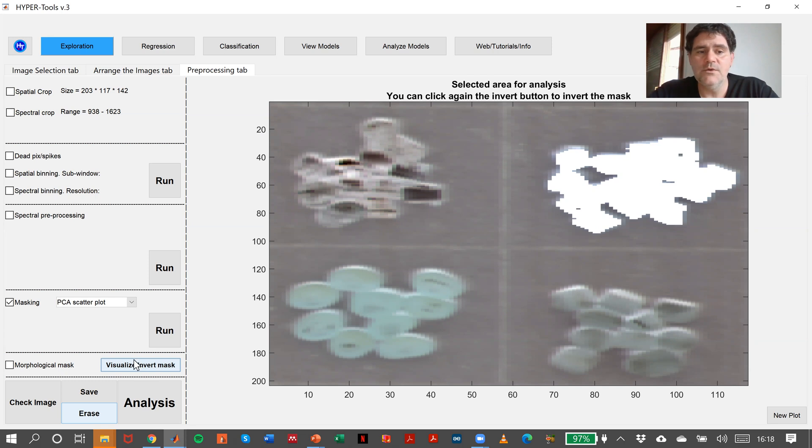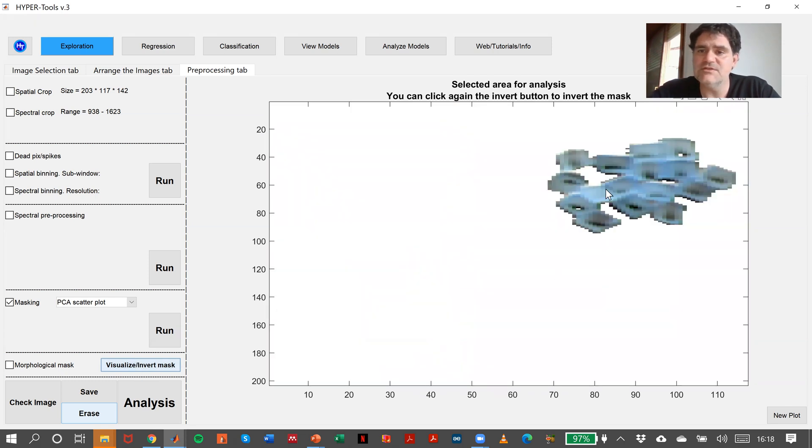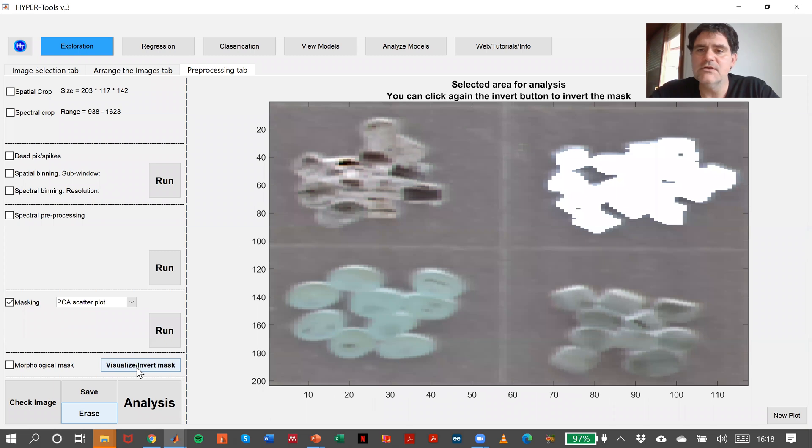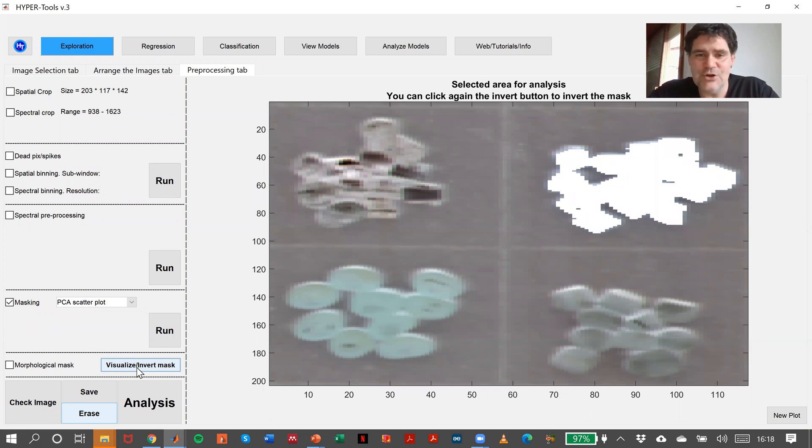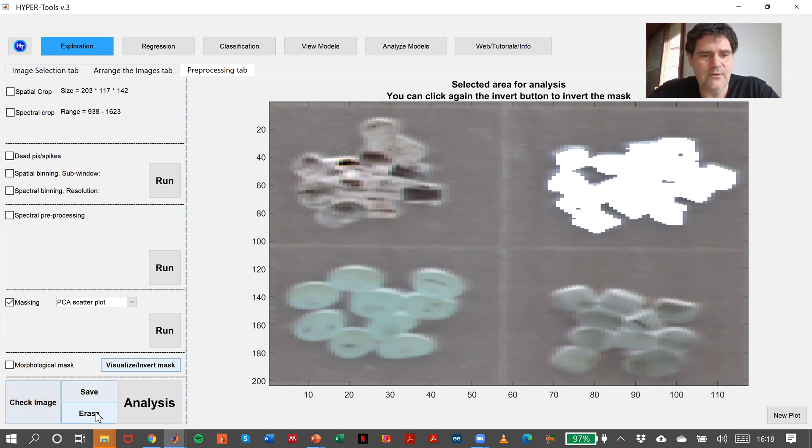With this button here, we have the ability of choosing this part for analysis or choosing this part for analysis. In this case, it's obvious that none of these choices is good. So I will just say erase.